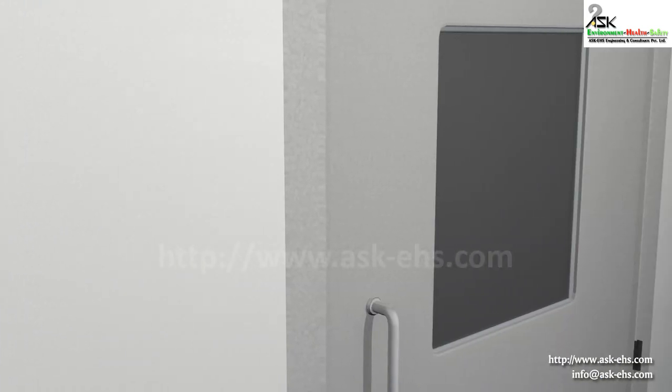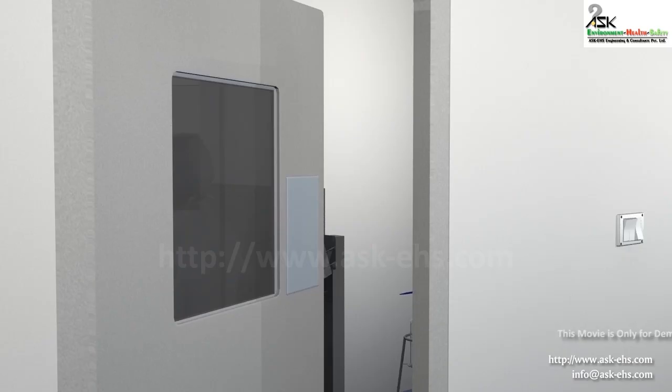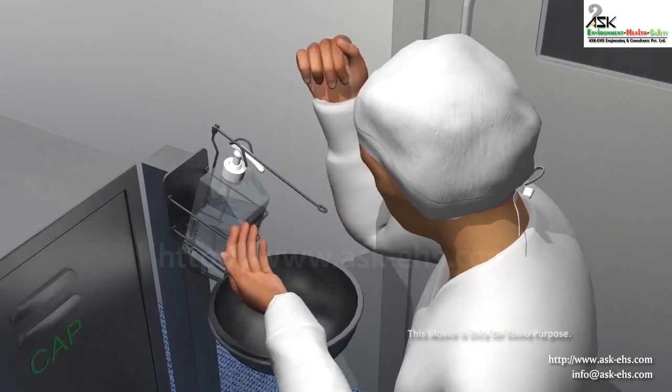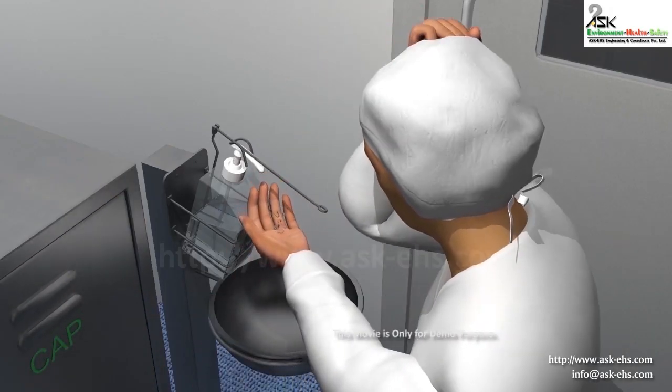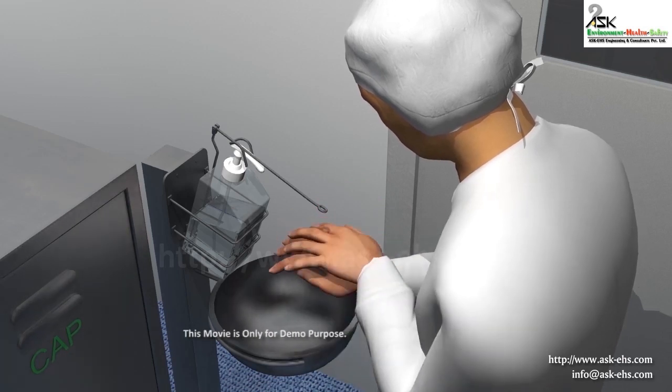Enter airlock 2 and push the dispenser with the help of your elbow. Sanitize your hands with the sterile disinfectant solution.